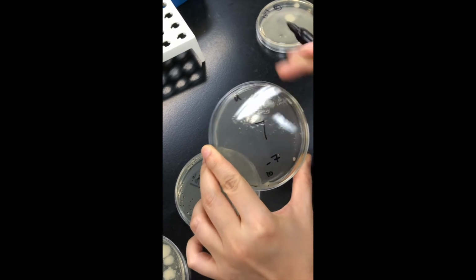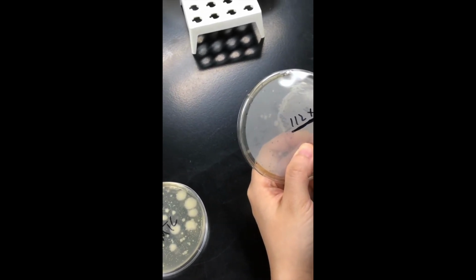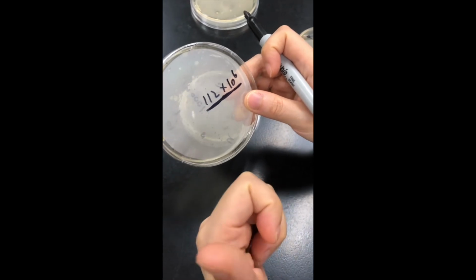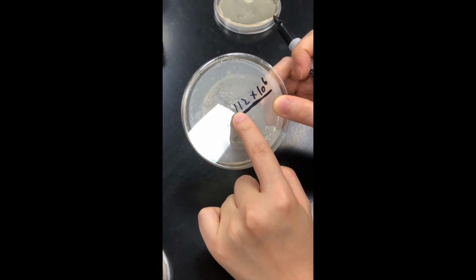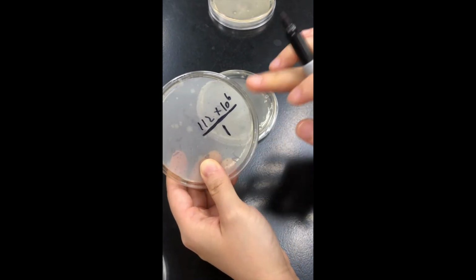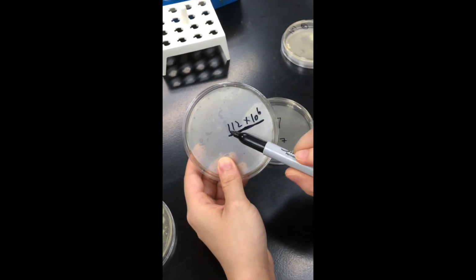So this is less than 30, and I have one plate good to use. This plate's number is between 30 and 300. Since I only have one plate to get a statistically significant number, I will only use this number to get the average CFU per ml. How to do this? Since we only have one number, we divide by 1 since we only use one plate. So this is my average of my unpasteurized raw milk sample.